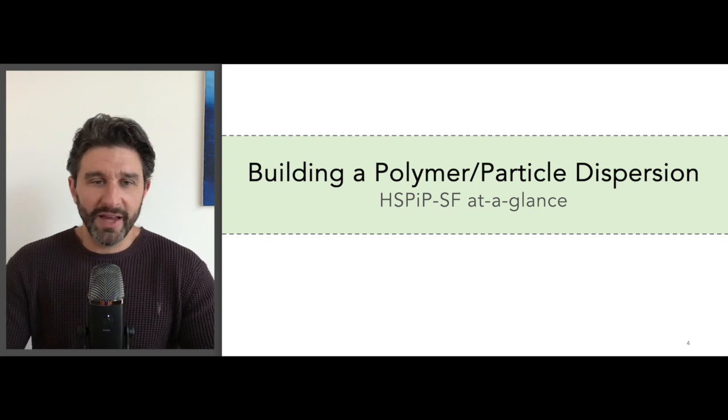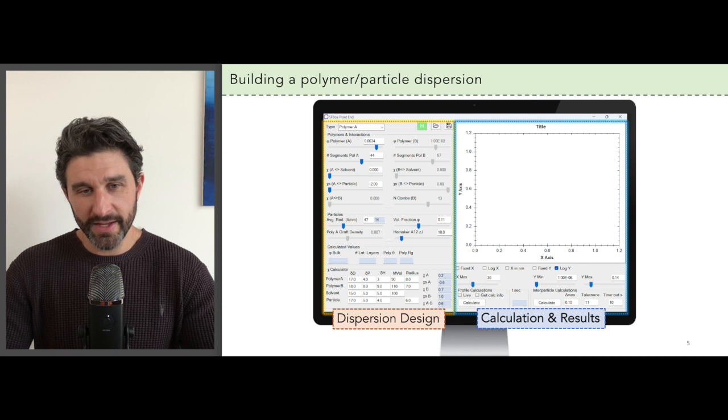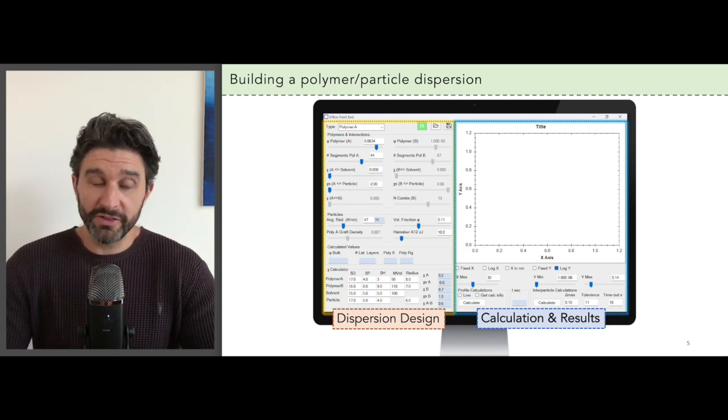So let's take a look at how to use this app in practice when you're building a polymer particle dispersion. Here you see the main window that you interact with when you use the app.